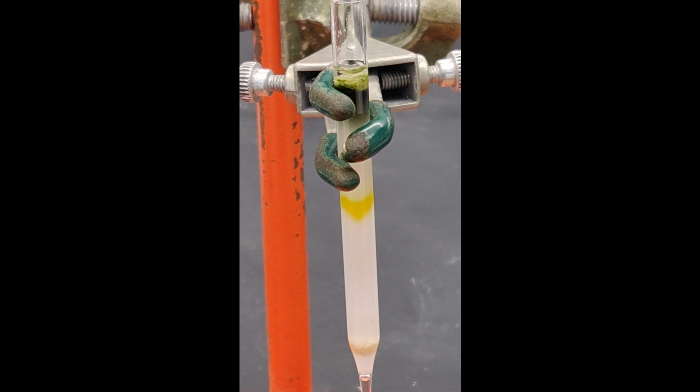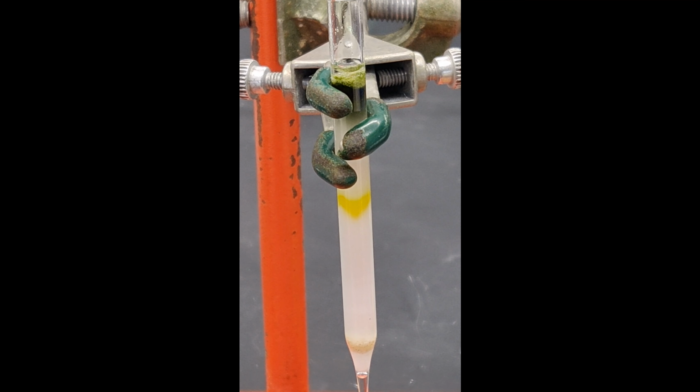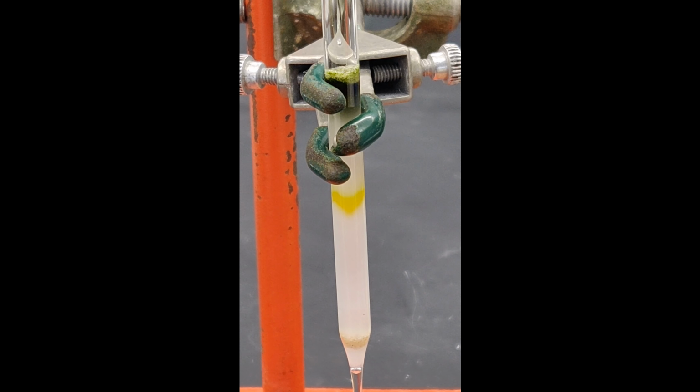Depending on how tightly the column was packed, how much cotton you used to make the column, and how tightly you pushed it into the pipette, the first color band of pigment could take 20 minutes or more to elute from the column.